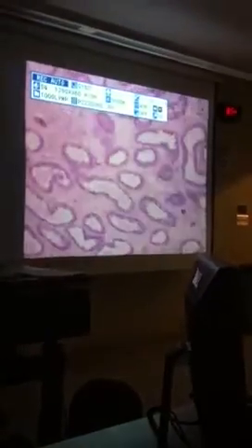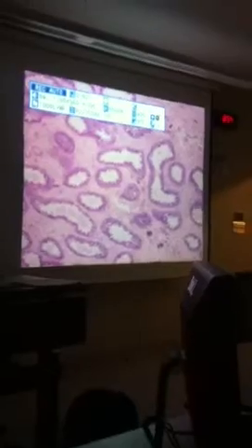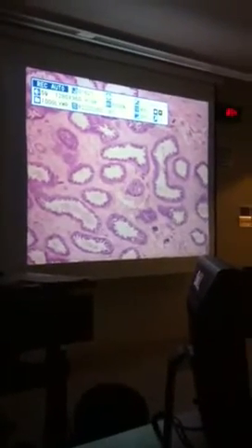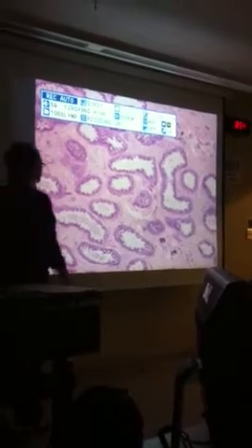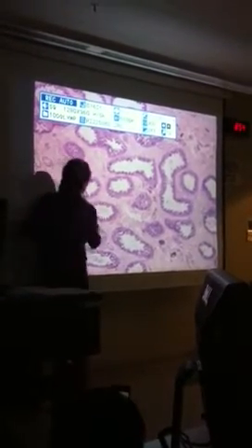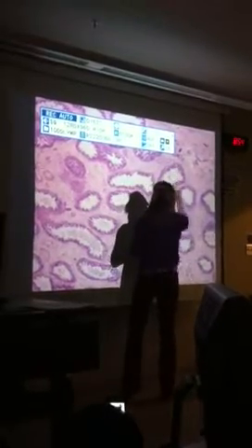Okay, then if we go over to the epididymis. These are the guys that you'll see microvilli, really long microvilli, and they're actually called stereocilia. So this is at 4x, and this is a cross section of the epididymis. So you see tubule, tubule, tubule, tubule, tubule, tubule.